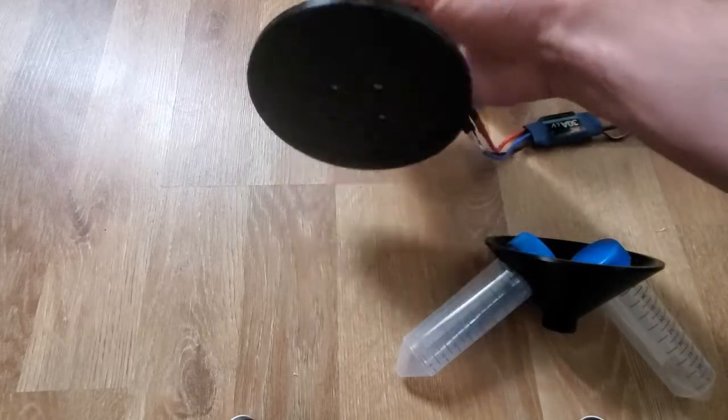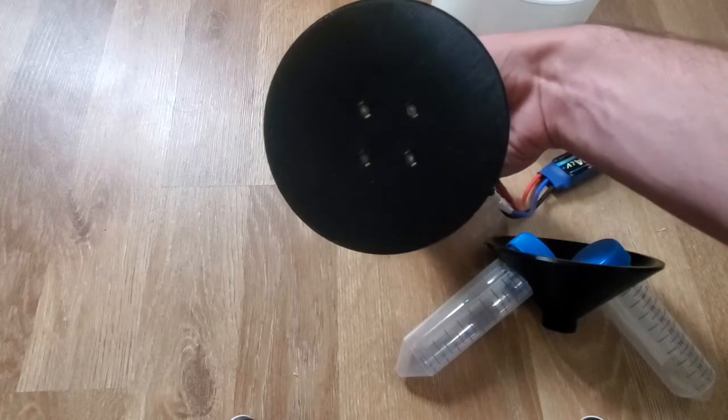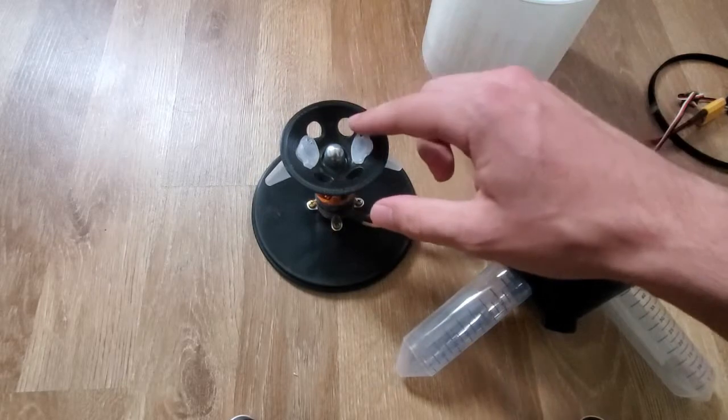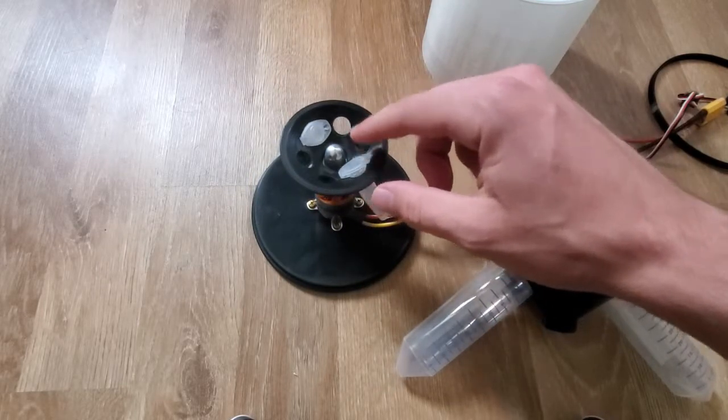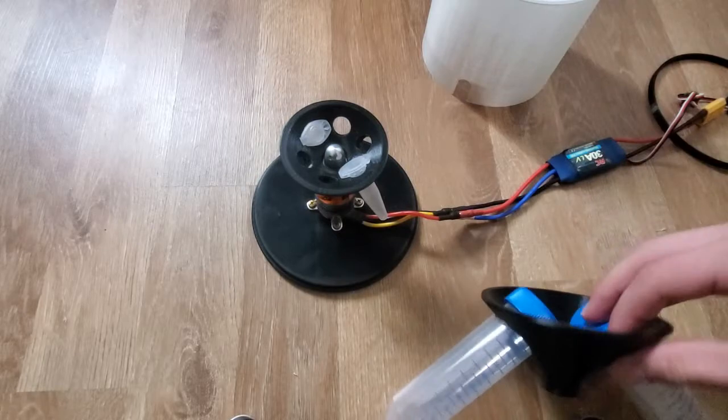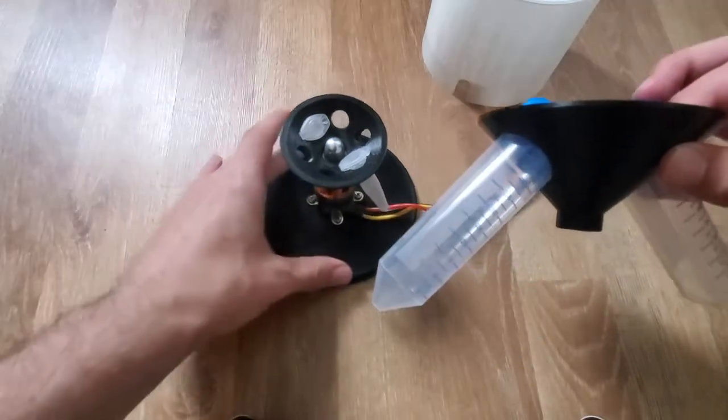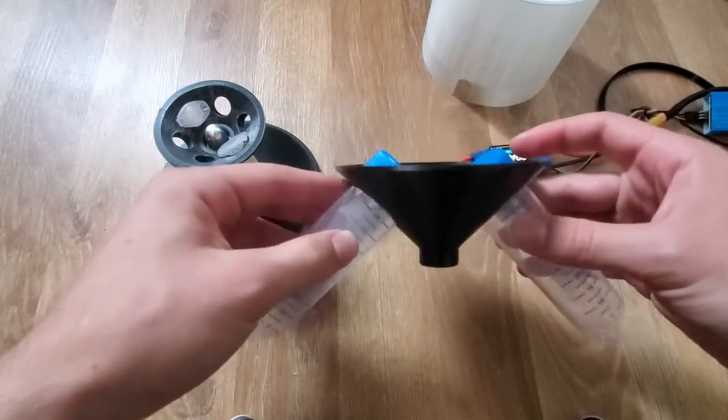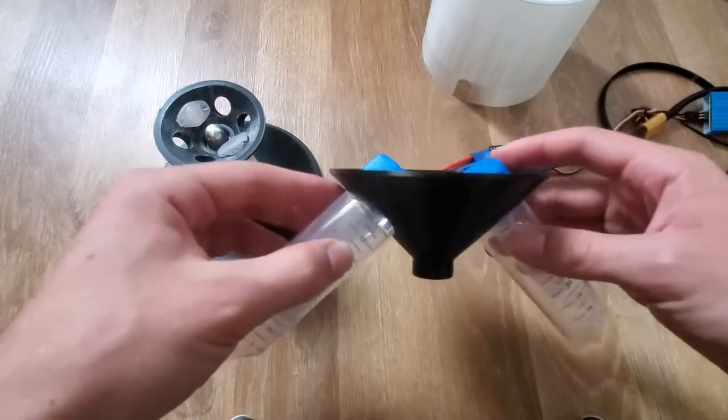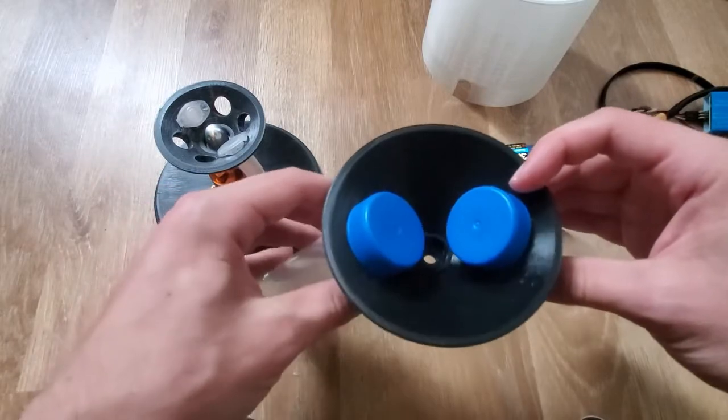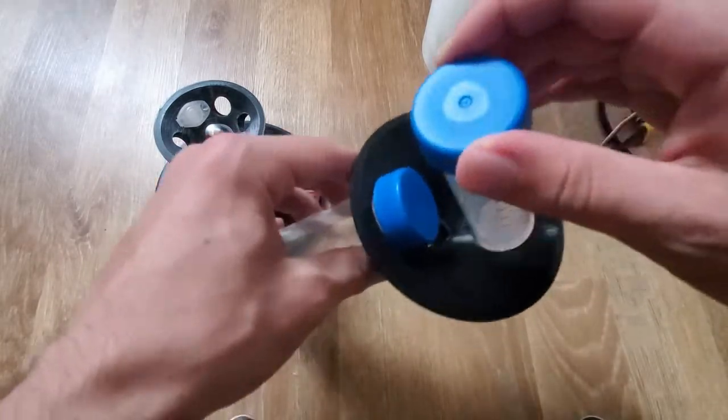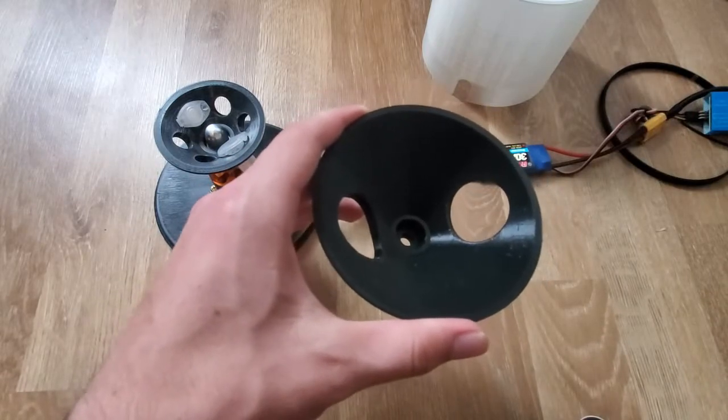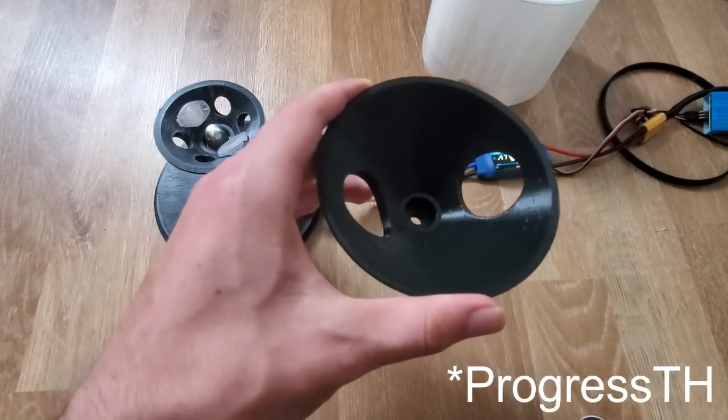The rotor holds the Eppendorf tubes. You can see here, this is a scaled-up version for 50ml tubes. Obviously I don't really want to run this one with plastic, but just so you can see what it looks like. These are actually from TH Progress on Thingiverse.